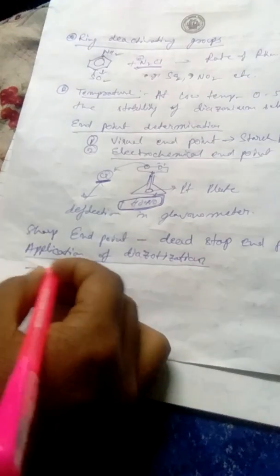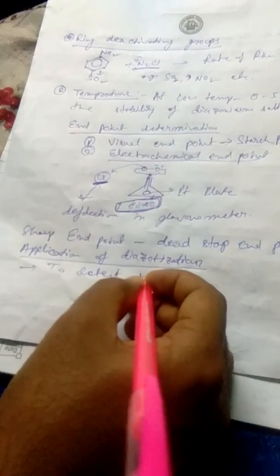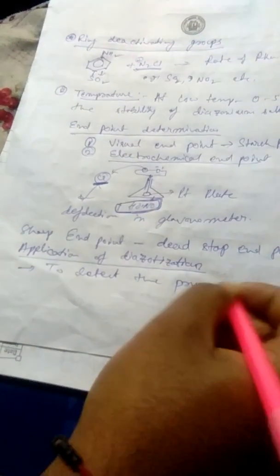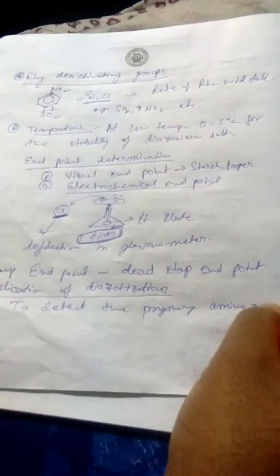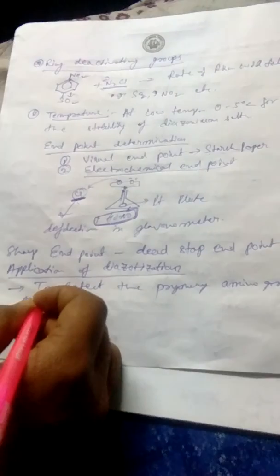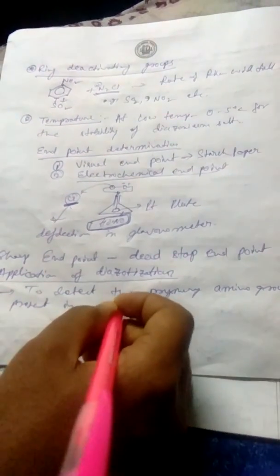So, to detect the primary amino group present in drugs.